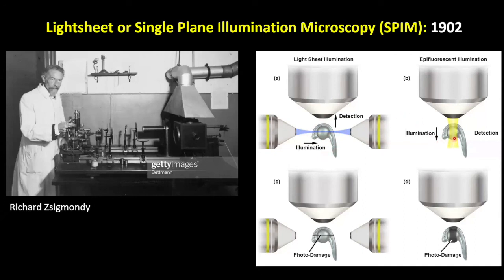So you can see, in regular epifluorescent illumination, the entire sample will be lit up by the light, but the light sheet only uses a thin layer as a light source to shine on the sample. But as you can see, because of light diffraction, the light sheet certainly works better with a more transparent sample, which is widely used in developmental biology, for example, in zebrafish or Drosophila flies or some plants. But with the clearing technology, tissues can also be used for this technology.